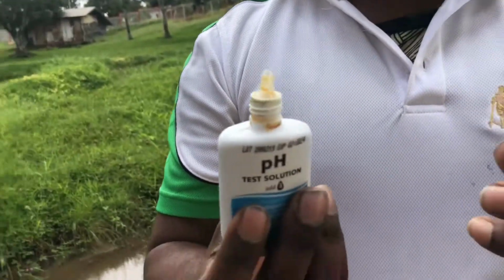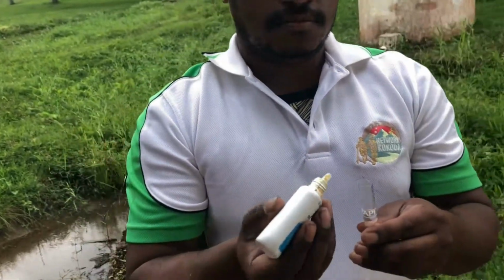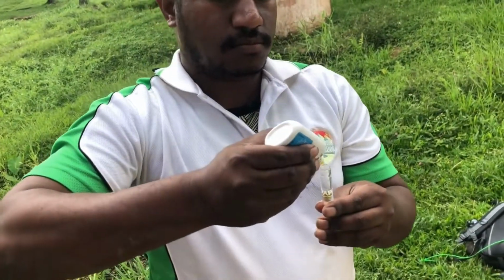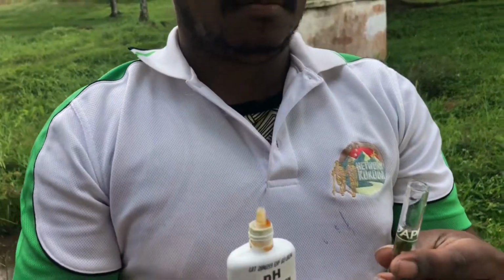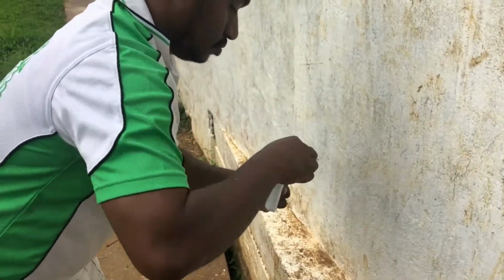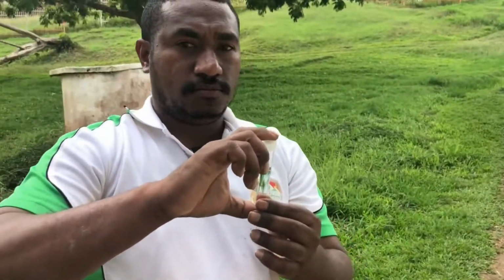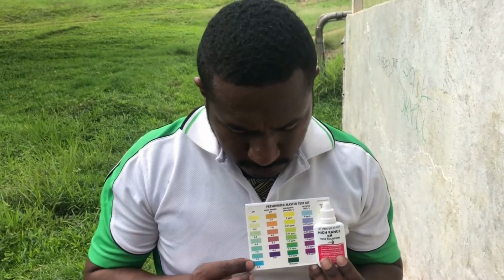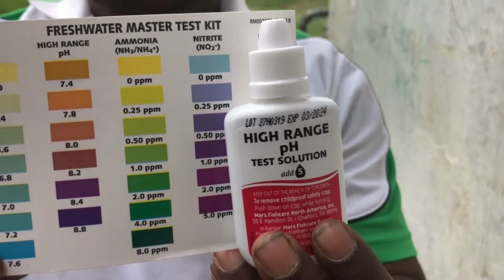Add 3 drops of pH test solution, holding the bottle vertically. Put the cap on, and turn upside down and back 3 times. If pH is very high, about 7.6, we'll do the high range pH test to get a more accurate measure.